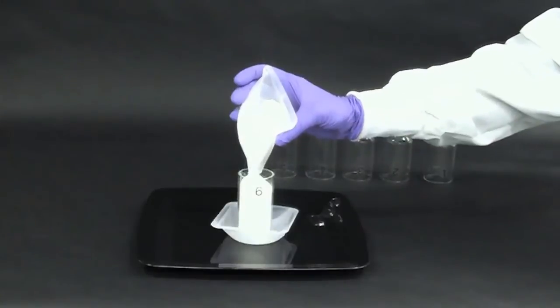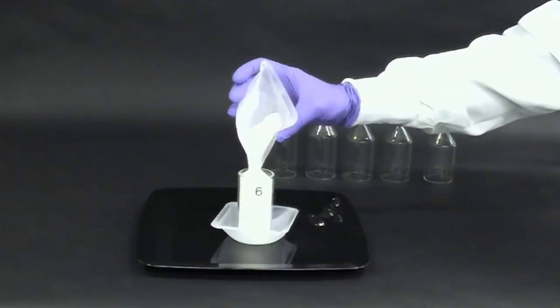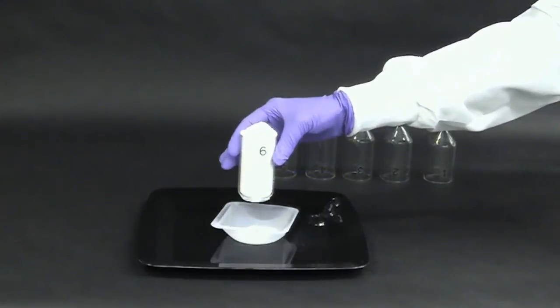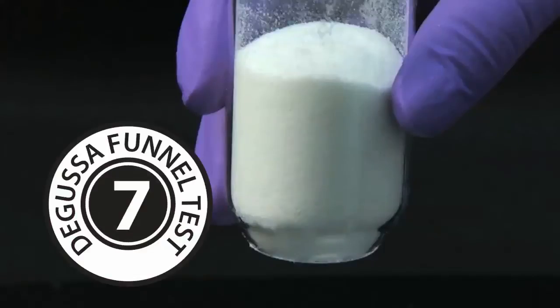A competitive equivalent product is then added to the first cylinder. The competitive Hypermelos cannot flow freely through the cylinder with the largest opening. The test protocol assigns this product a score of 7.